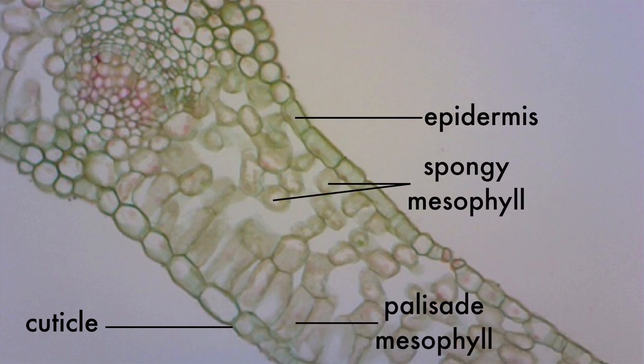This slide is turned around, so the bottom of the leaf is actually being viewed from the top. You can also see in the top left corner a vein of the leaf. The stoma is a tiny hole made by two curved guard cells, and here we can see it.